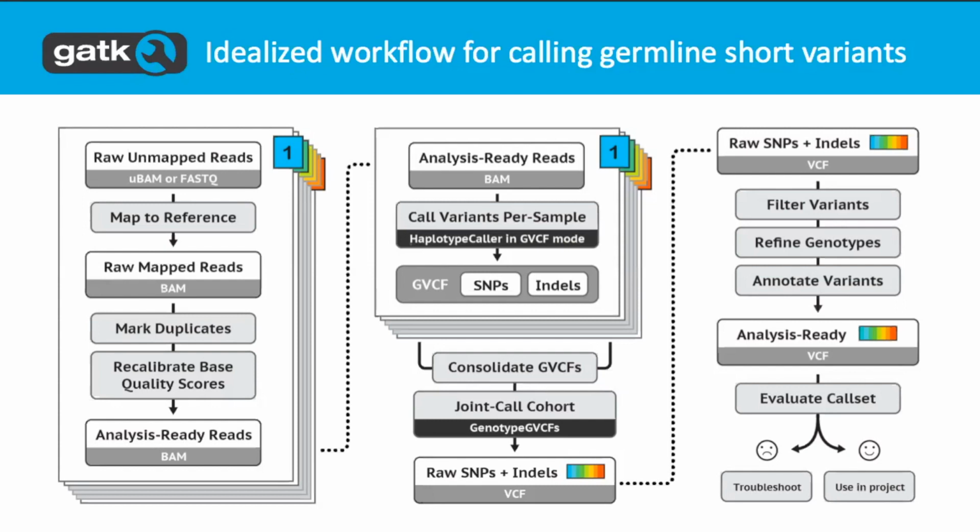There is a paper about haplotype caller authored by Laura Gauthier and others on the team, where she did titration experiments to see, as you add more samples, what's your increase in the fidelity of the variant calling, and what, if any, drawbacks might start to creep in. As I recall, she didn't compare that to the deep learning approach, because CNN wasn't ready at that time. So it tracks the gains.